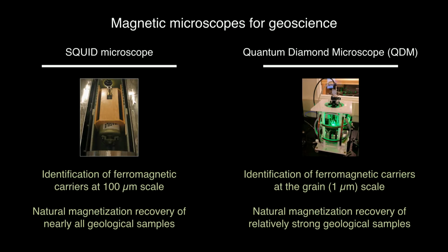Could you use the Helmholtz coils? They don't go very high. They can do maybe the first couple of AF steps. At some point you'll start melting down the metal components, but we haven't tried it. It's definitely an intriguing idea to increase throughput. Right, so you just push a button and it does the whole sequence overnight or something.